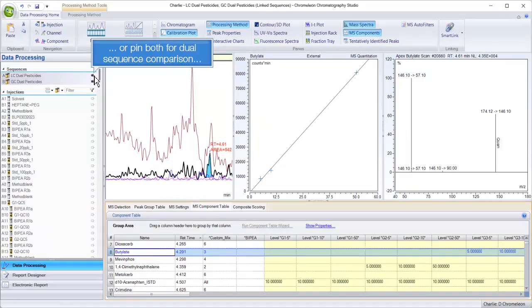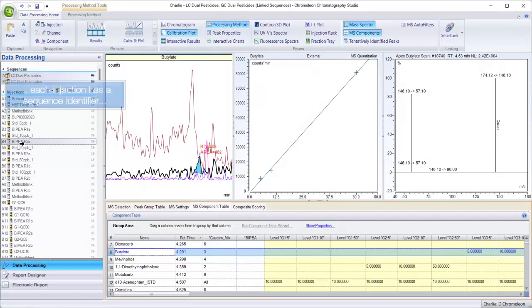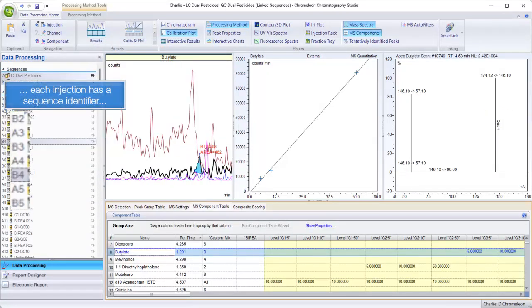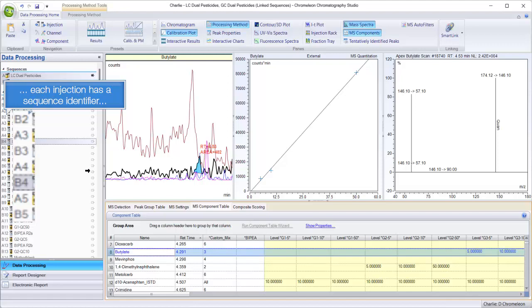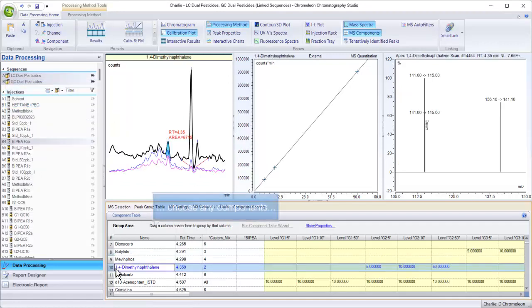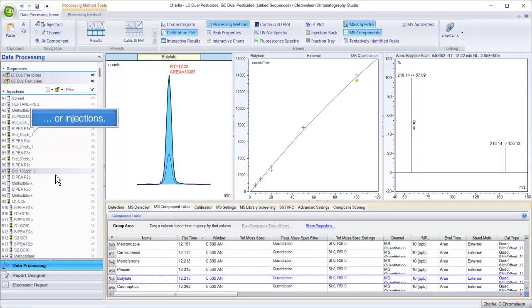Or pin both for dual sequence comparison. Each injection has a sequence identifier. Choose any components or injections.